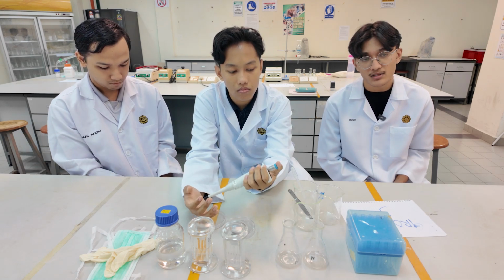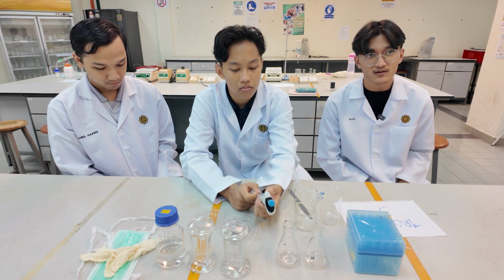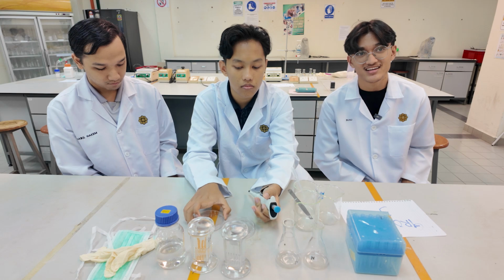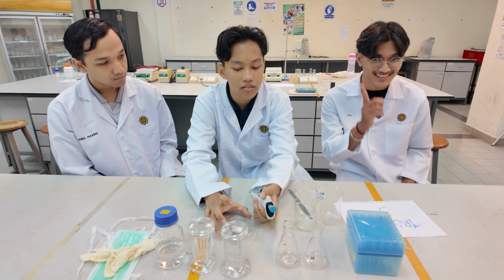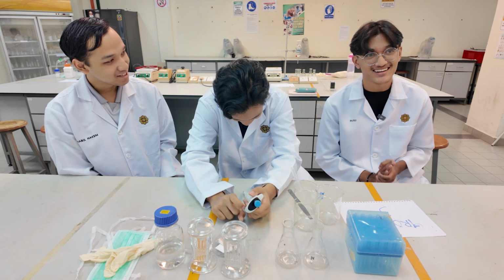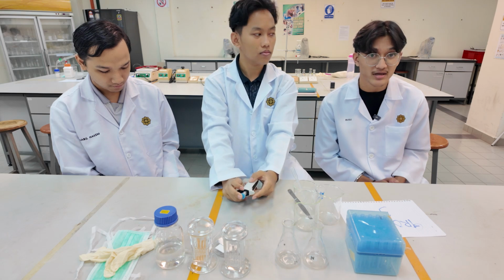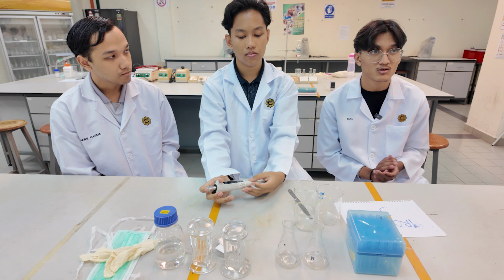And then for the second example, we use TLC also to check for additive coloring in spices. Do you know that in Sudan, the country, they use this additive coloring in their chili powder? Don't know, right? I tell you right now. They use red dye coloring for the chili powder to make the color more vibrant, so that the customer will buy it. But this additive coloring is actually harmful to humans when they consume it.